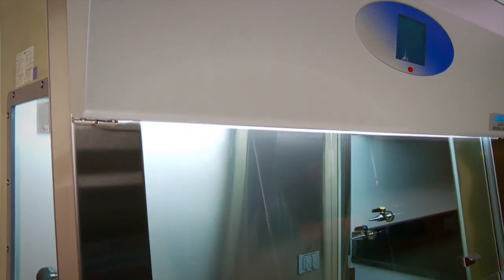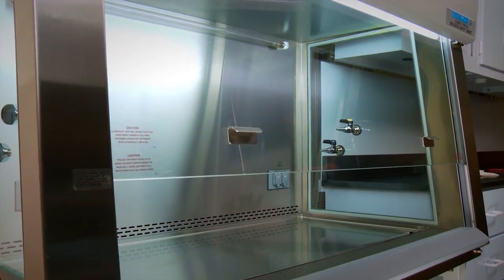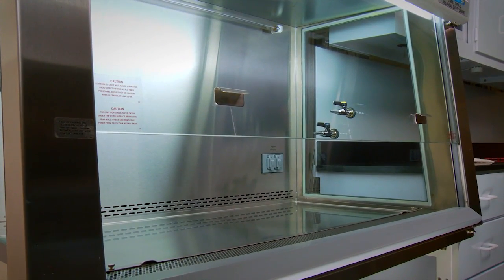The cool light lighting in NuAir cabinets reduces glare, making it easier to focus on your work while reducing eye fatigue.